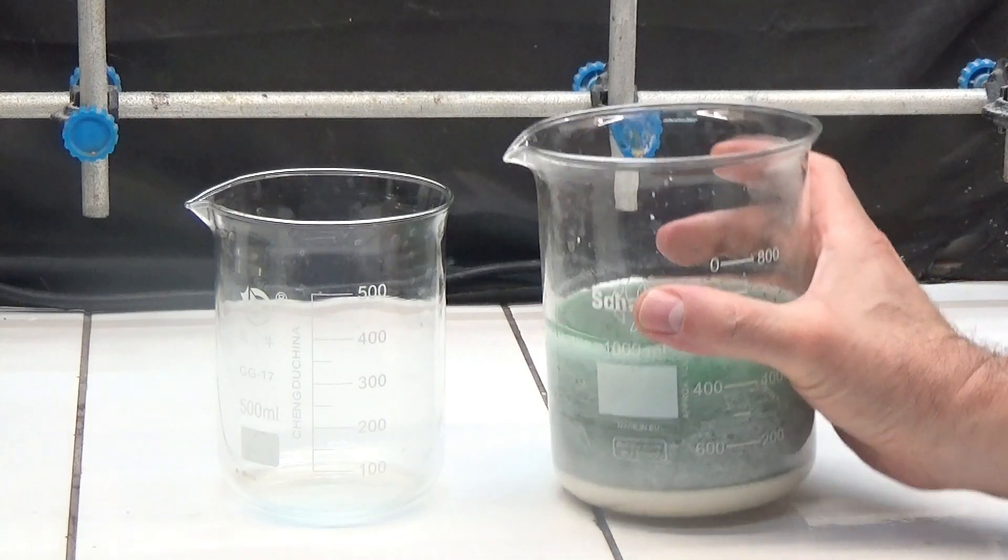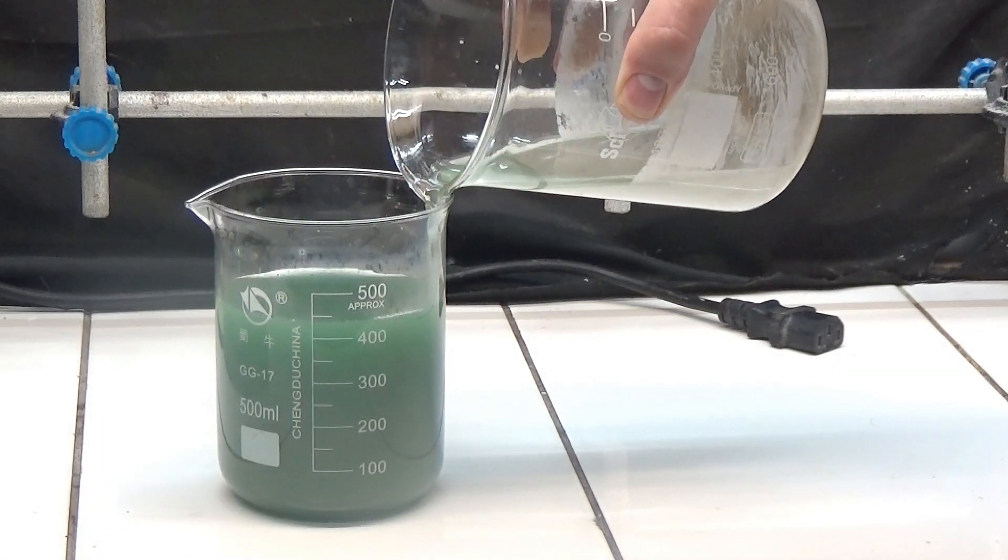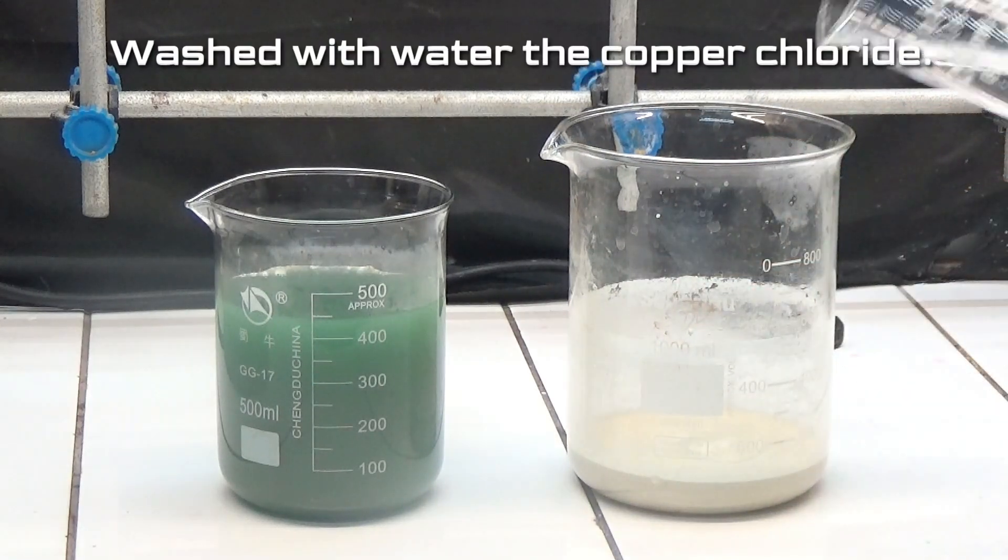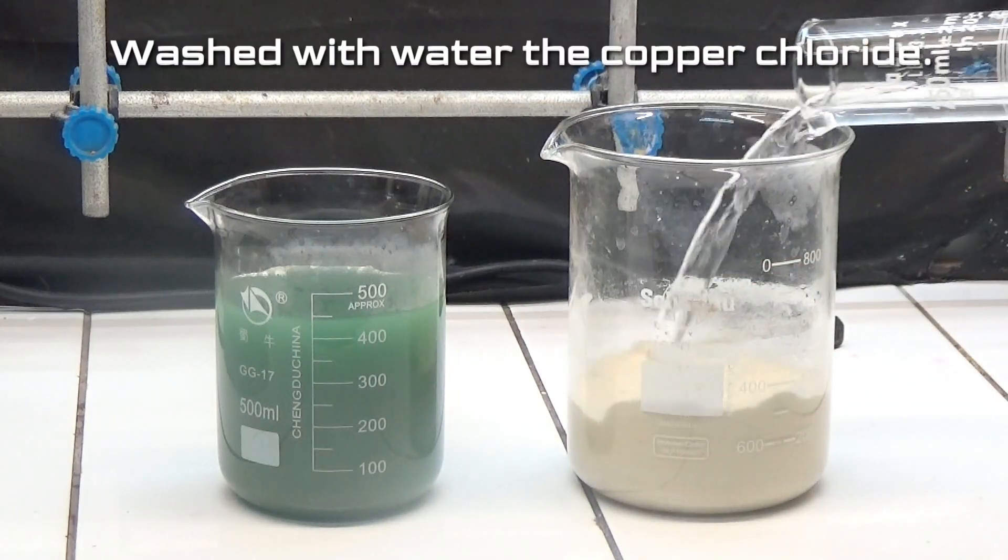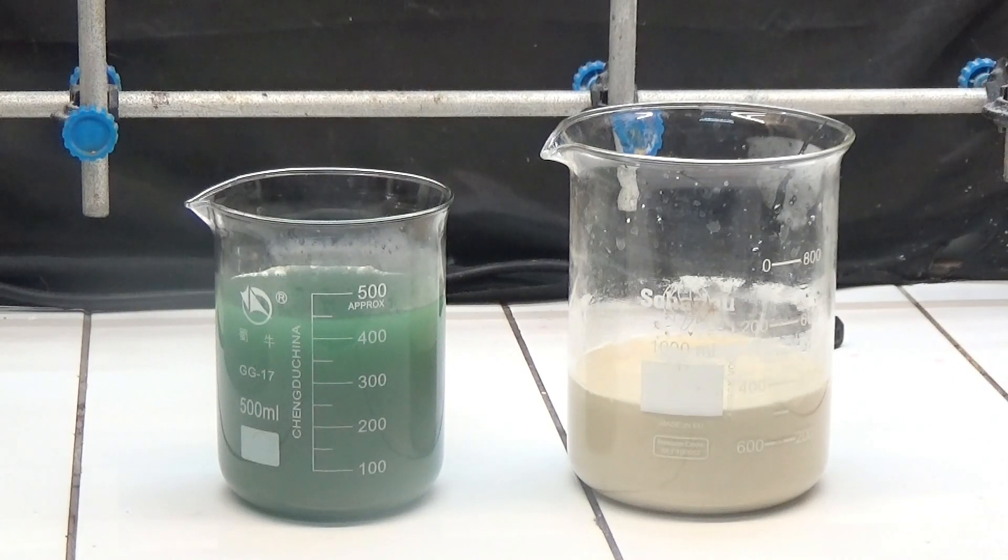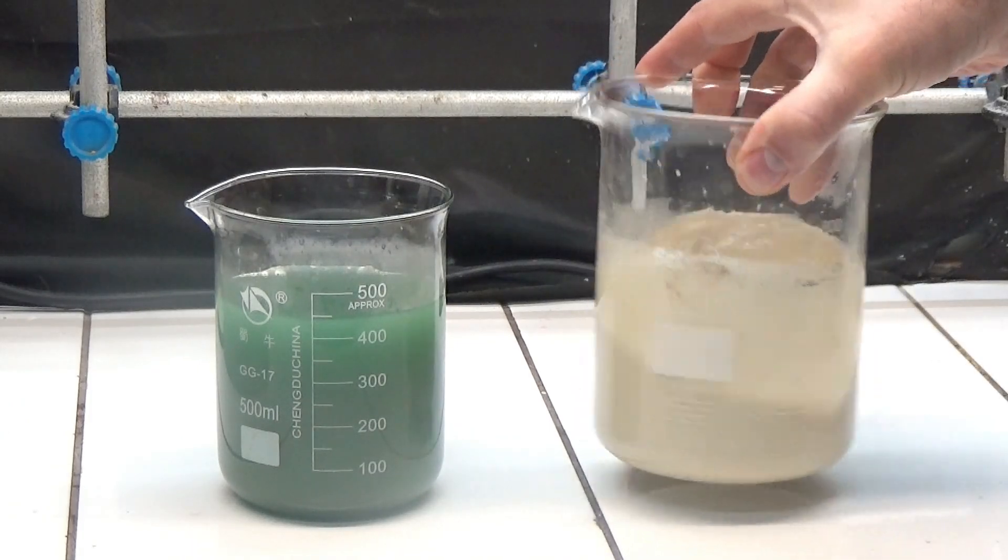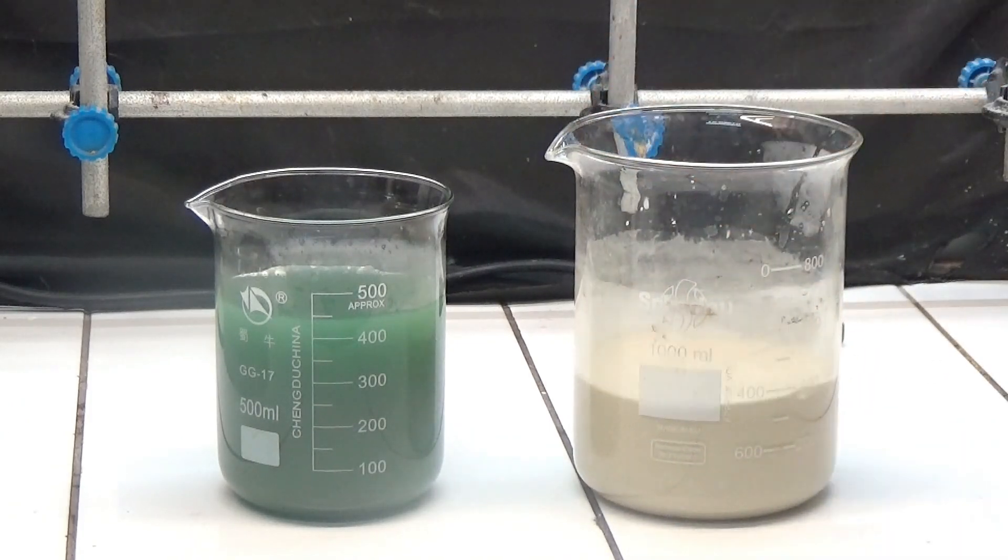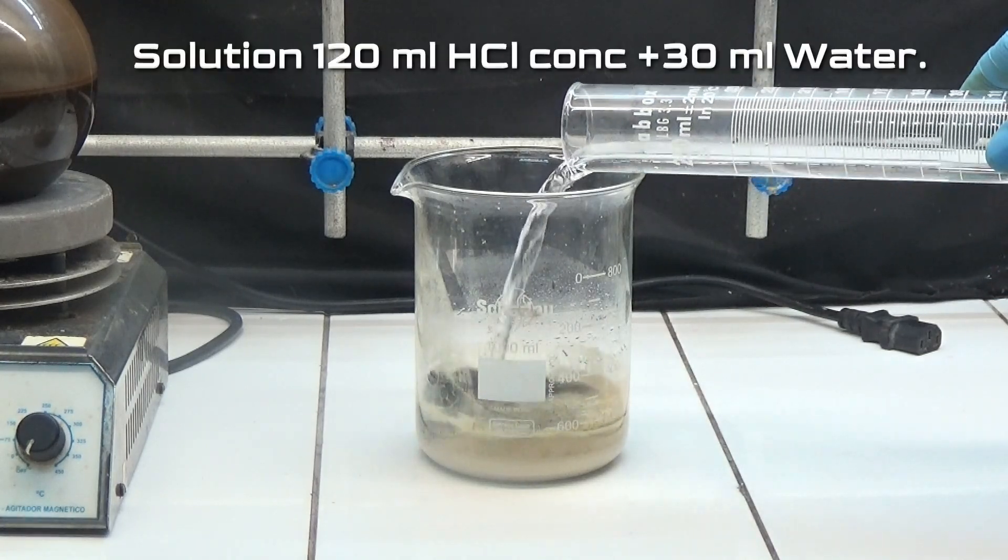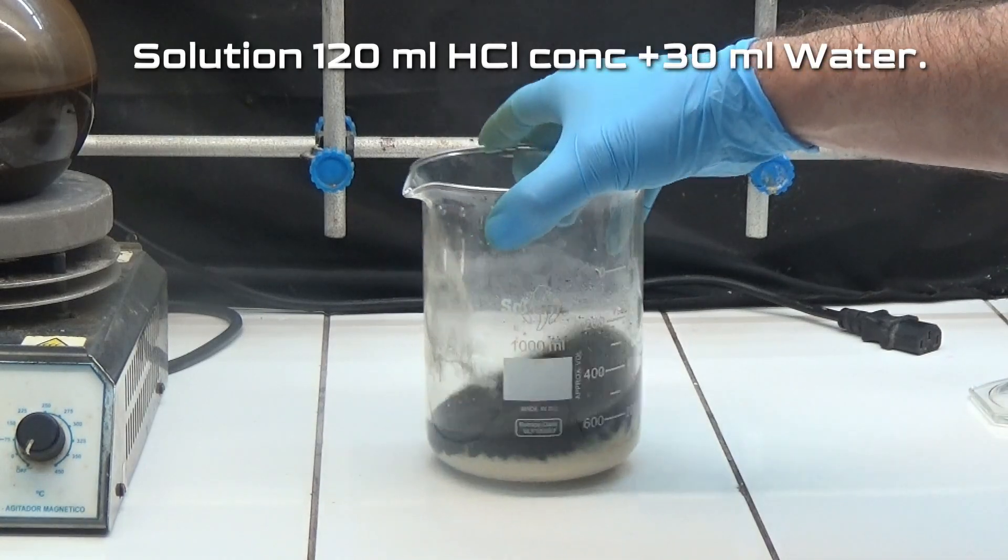We allow to decant. We eliminate the liquid above and wash with water the copper chloride. We decant again, eliminating the liquid with precaution. We dilute the precipitate in a solution of 120 milliliters of concentrated hydrochloric acid diluted in 30 milliliters of water.